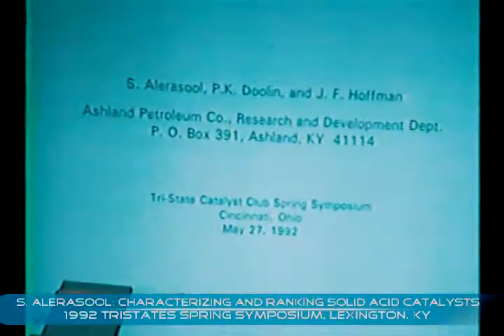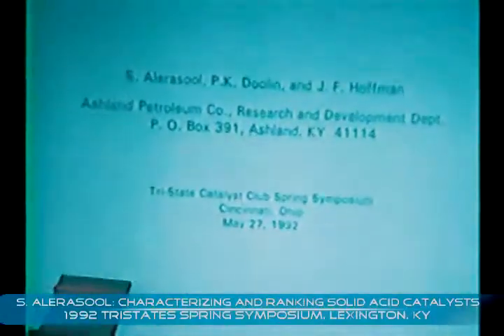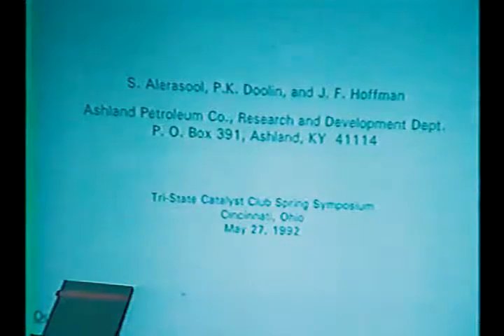What we try to do then is to characterize the catalyst as best as we can, and of course, the primary driving force behind the catalytic cracking process or reaction are the acid sites. And what we have decided to do more recently is to incorporate acidity determination into our catalyst evaluation program.